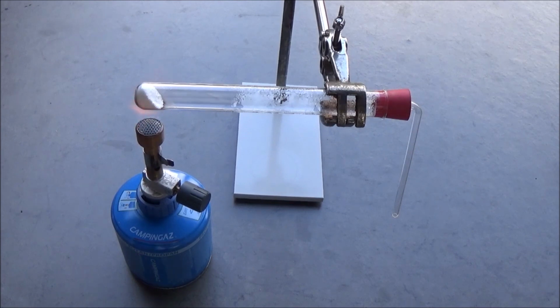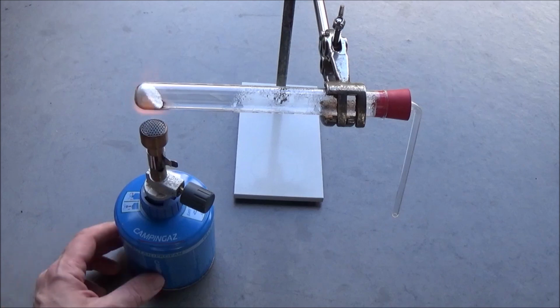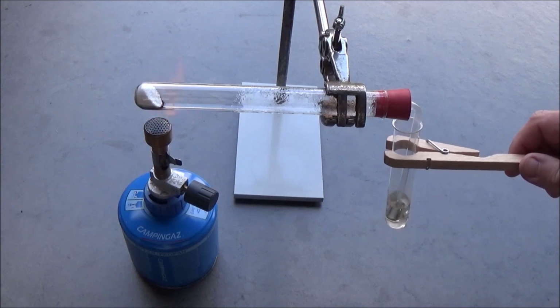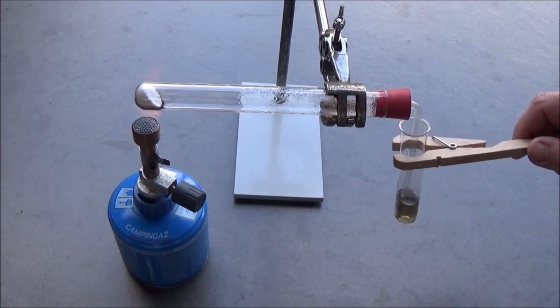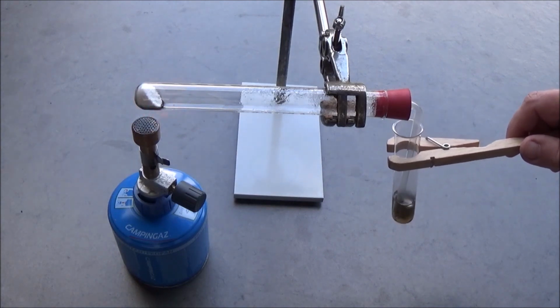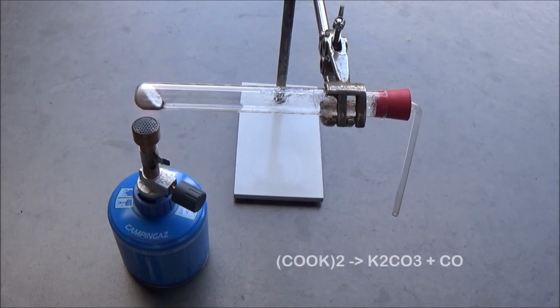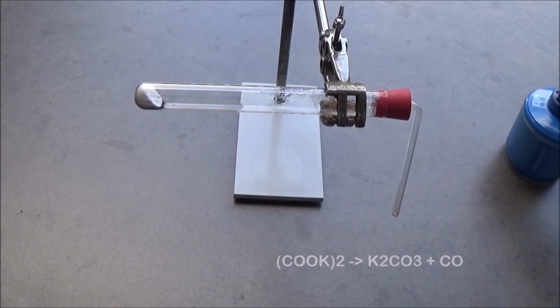Because of the toxicity of carbon monoxide, we move the pyrolysis outside. About 5 spatulas full of potassium oxalate are placed in a test tube, which is then clamped horizontally in a tripod clamp. The oxalate is strongly heated in it, and the resulting gases are introduced into the reagent solution via an angle pipe. The previously clear solution turns black from finely divided metallic silver, which is a result of the reduction of silver ions with carbon monoxide. This was previously formed from the oxalate with the formation of potassium carbonate.